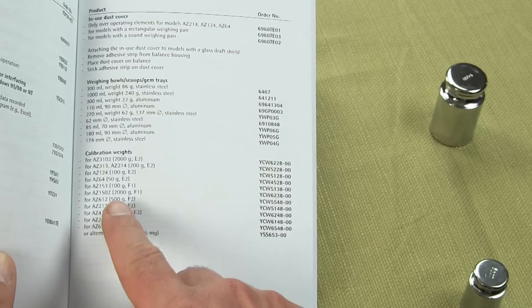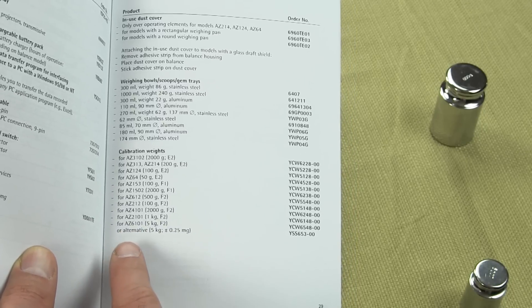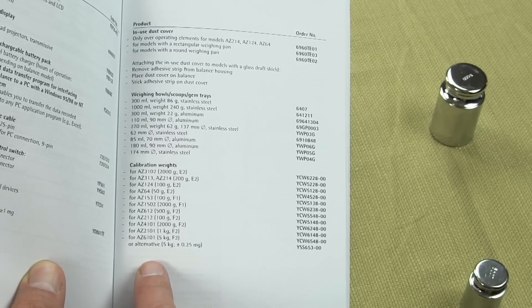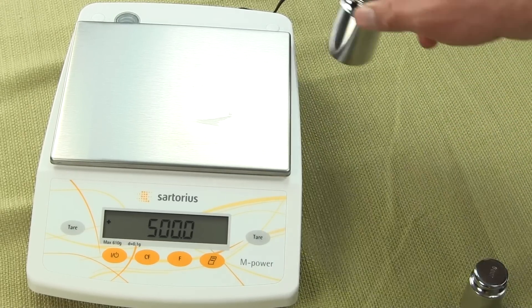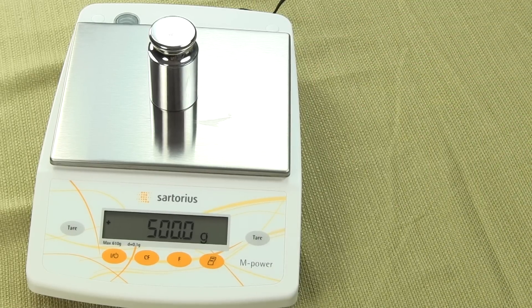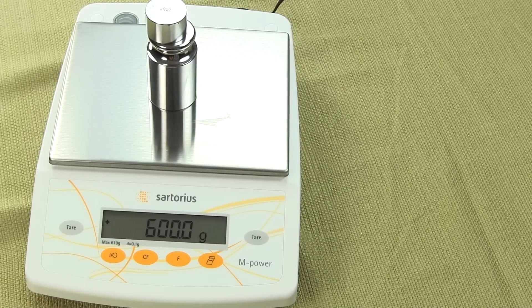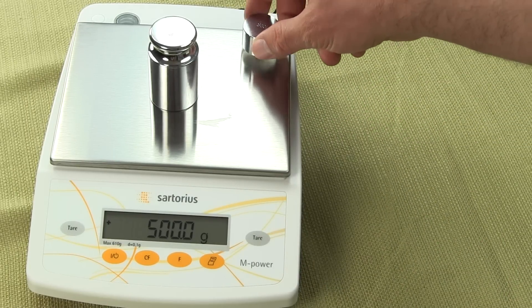We're using the AZ601 and it requires a 500 gram weight. To do calibration, all one simply needs to do is put on the 500 gram weight and the scale beeps after it's accepted its calibration. I have a 100 gram weight over here — put the 100 gram weight on and you can see the performance of the scale. It's quick and it's accurate.